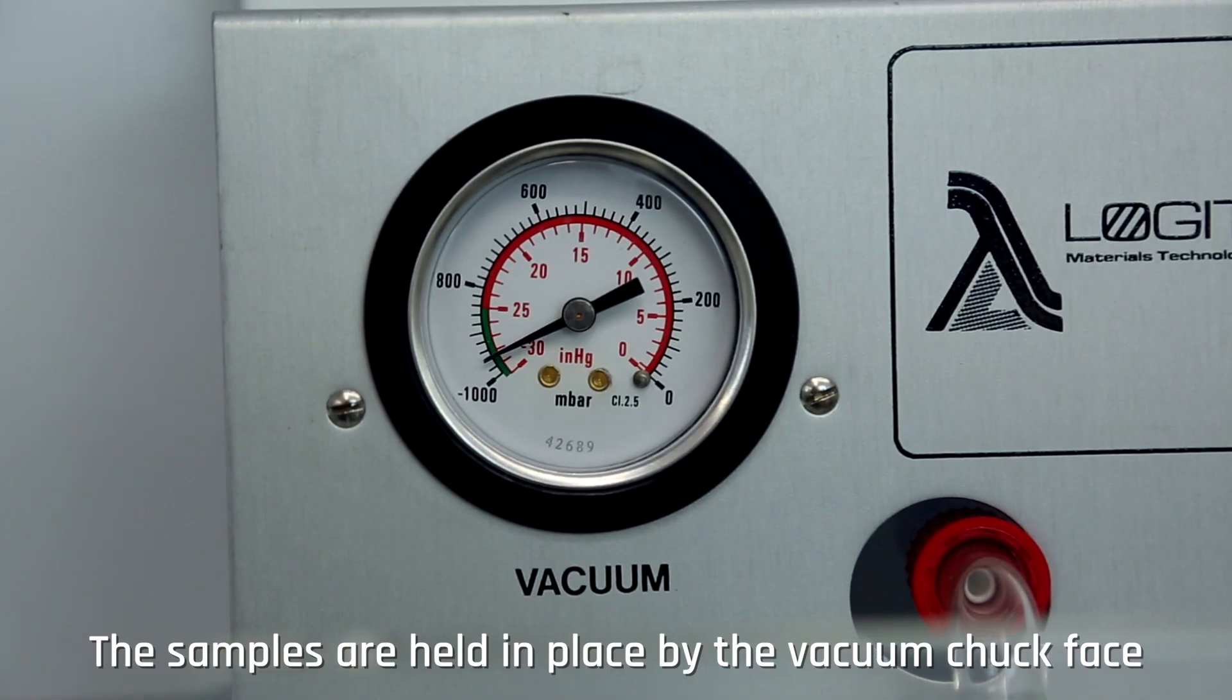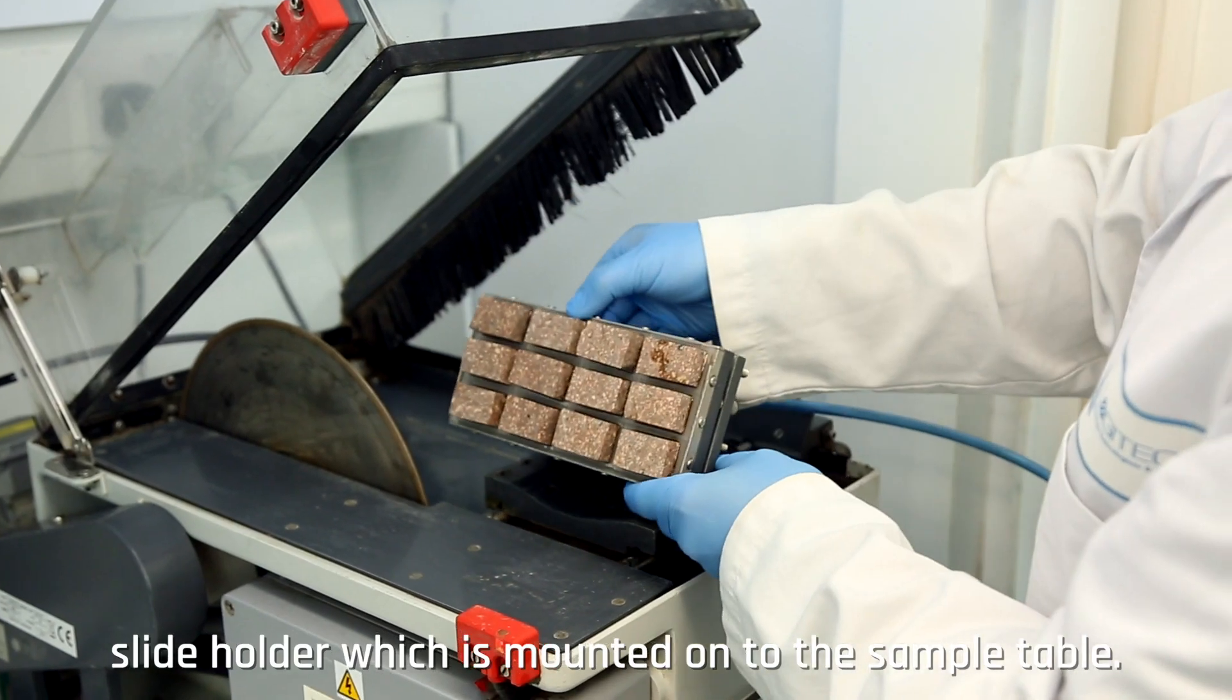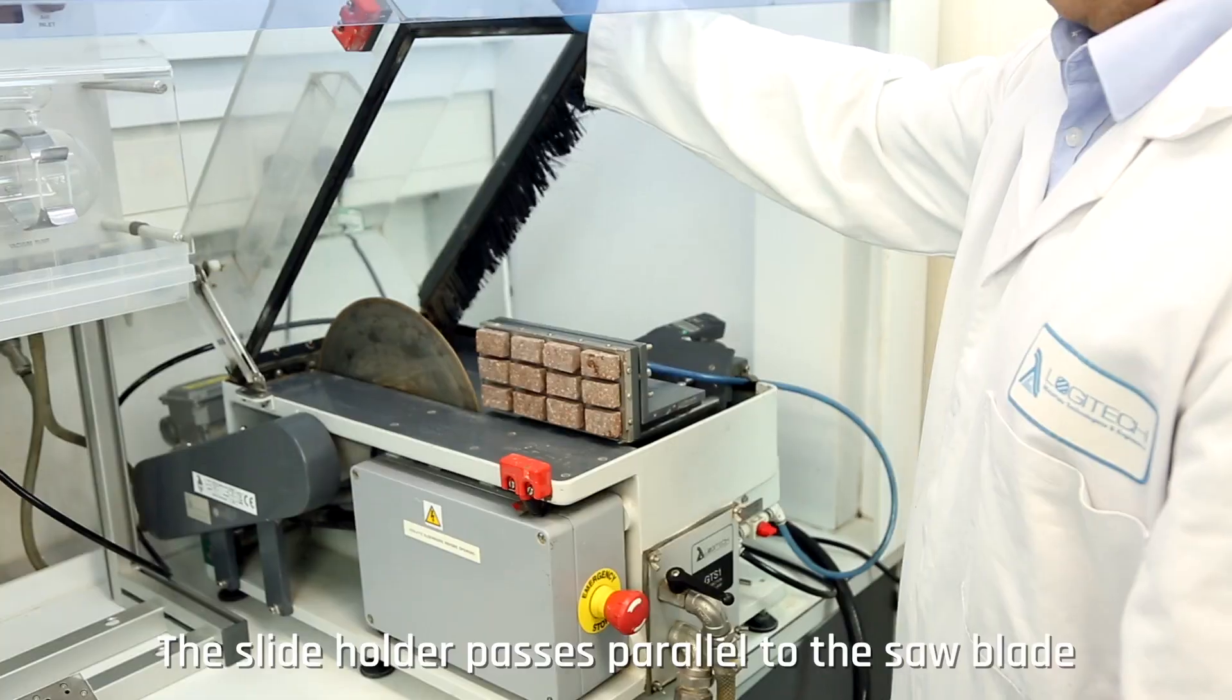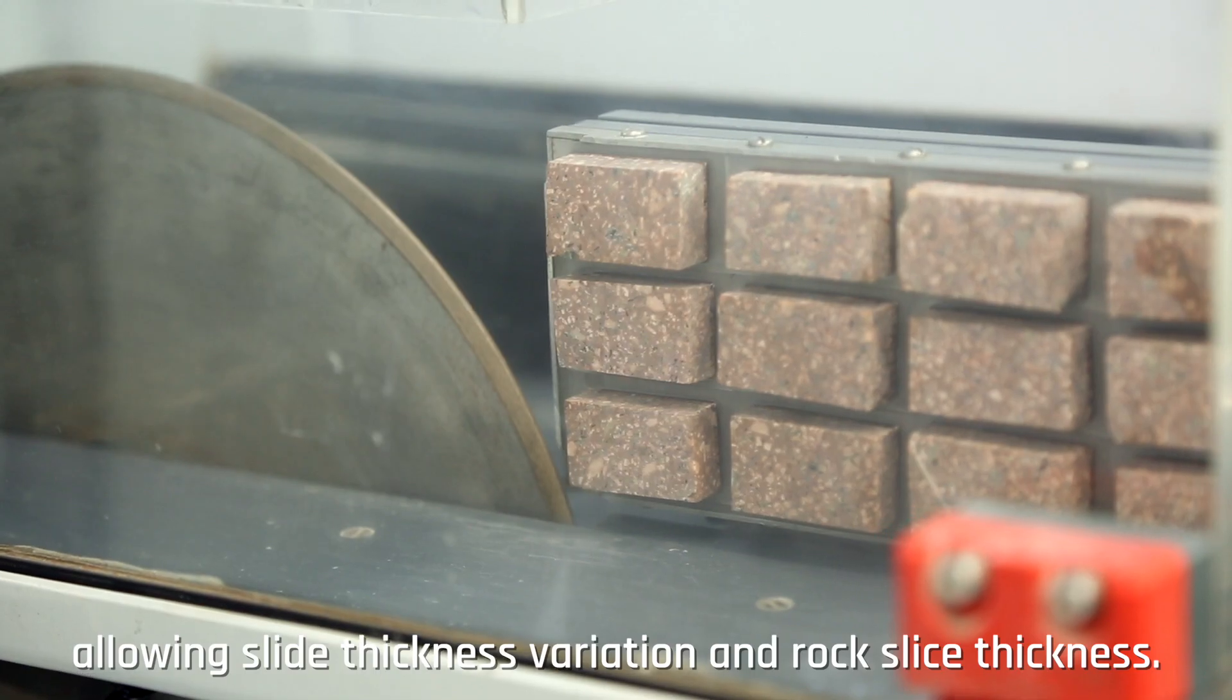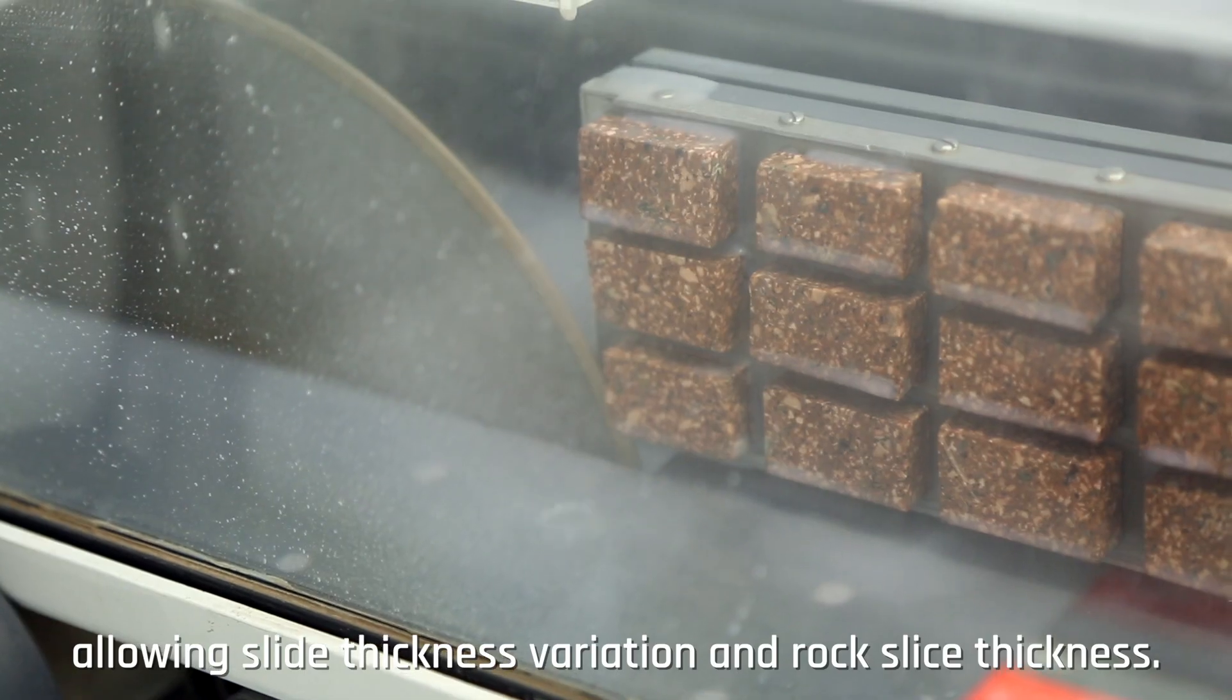The samples are held in place by the vacuum chuck face slide holder, which is mounted onto the sample table. The slide holder passes parallel to the saw blade at a user-adjustable distance, allowing slide thickness variation and rock slice thickness.